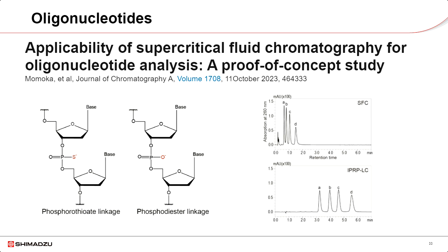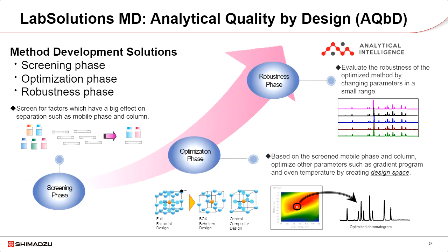We've talked about a number of ways of unleashing your chromatography, but we haven't really talked about software. And so at this point, I want to switch into the software realm and talk a little bit about LabSolutions MD, which is an analytical quality by design software that gives you solutions for method development. Now, this could be a webinar all on its own, but for the purpose of this webinar, I'm just going to go over things very briefly. And if you have any additional questions, please reach out to us.